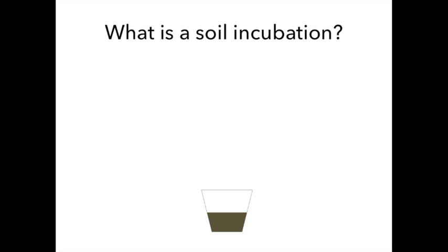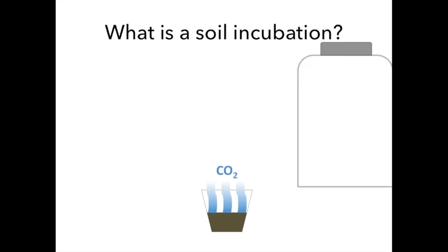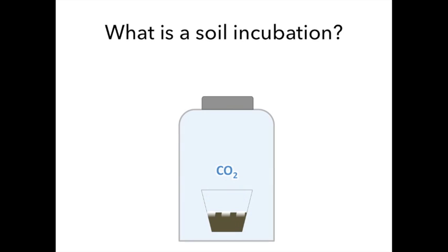In our case, we are curious about soil CO2 efflux, so we will be measuring the amount of CO2 leaving our soils. In order to do this, we will put our soil samples in airtight jars so that the CO2 released by the soil builds up over time and we can measure it.